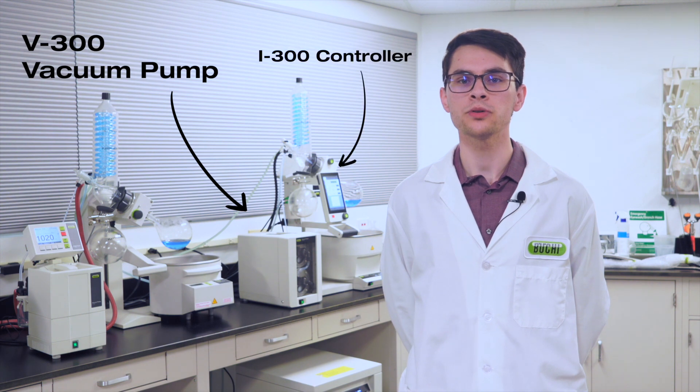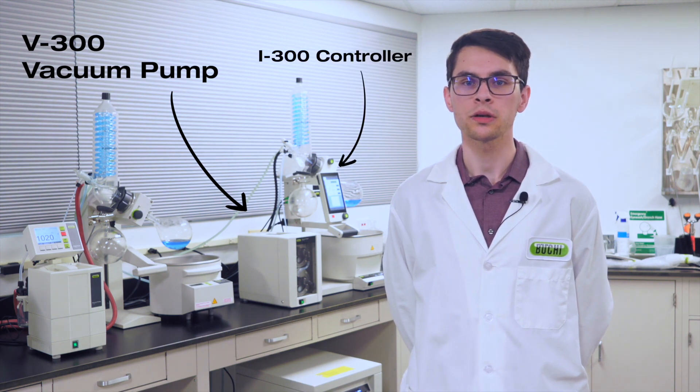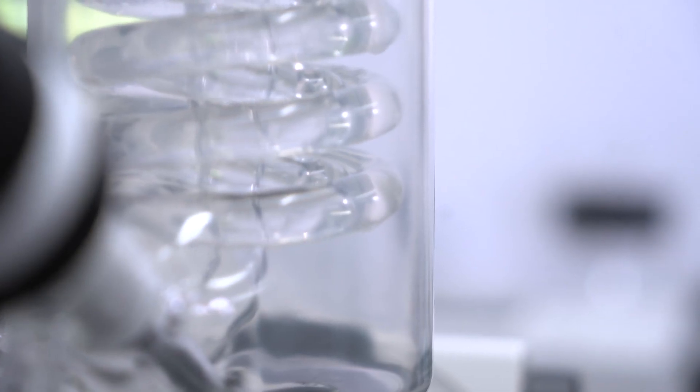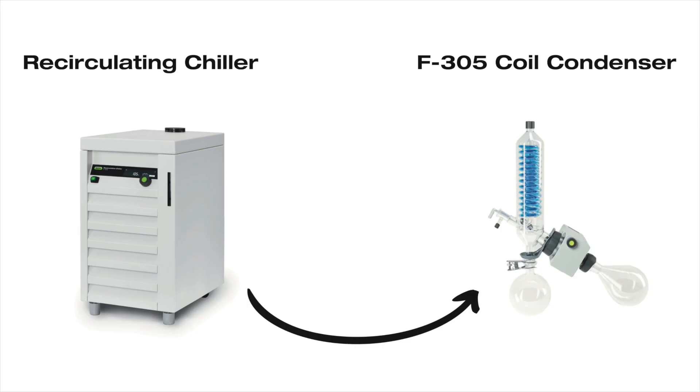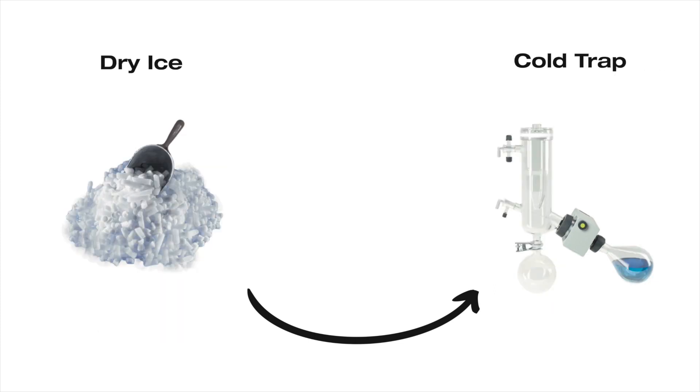When viewed as a system, a vacuum source — ideally regulated by a controller — connects to the condenser to reduce pressure and make evaporation more favorable. Depending on the style of condenser, a chiller may be connected to a coil condenser, or a cold trap filled with dry ice and a suitable solvent like acetone or isopropyl alcohol.